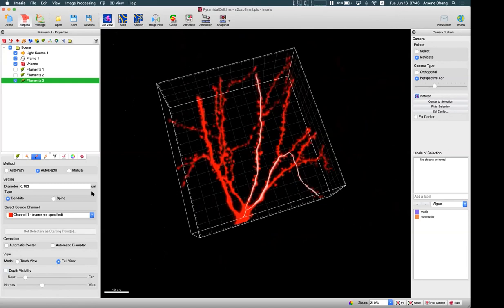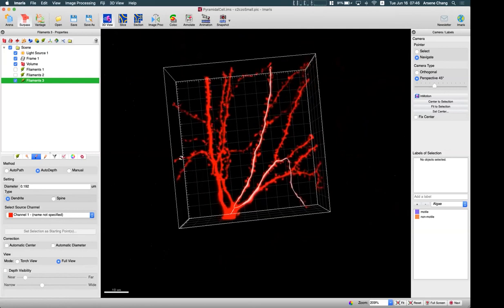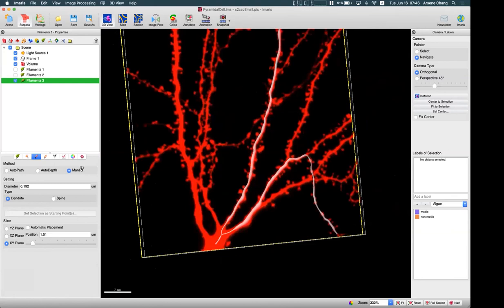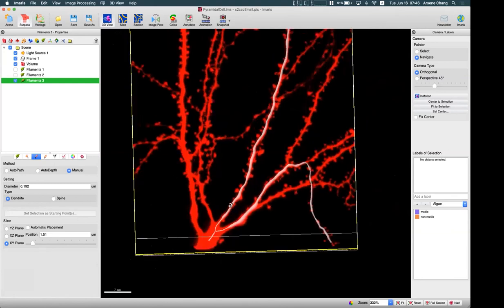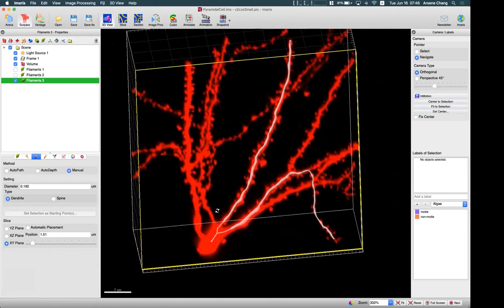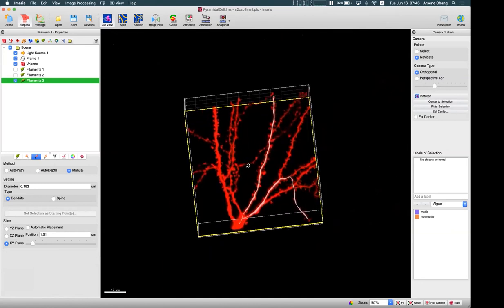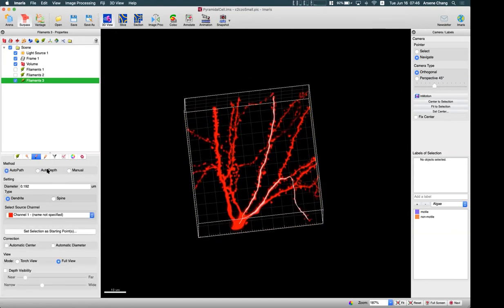These are the different views you can apply when doing semi-automatic tracing to help identify the specific branch location. That covers auto path and auto depth. The manual algorithm lets you draw on a single plane, but it's not very popular, so I won't spend much time on it — but you can try it if you want.